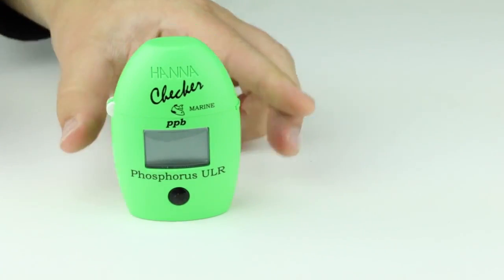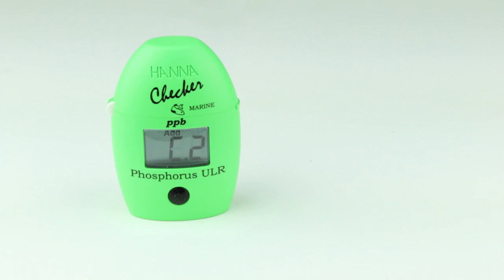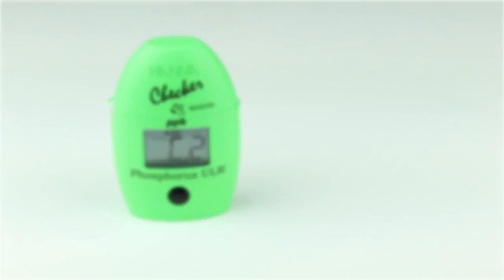Press the button. Once the screen shows ADD-C2, remove the cuvette from the meter and add one packet of HI736-25 reagent.